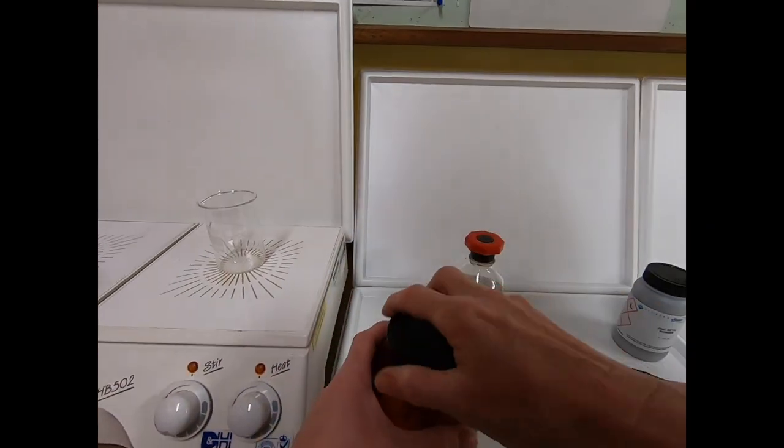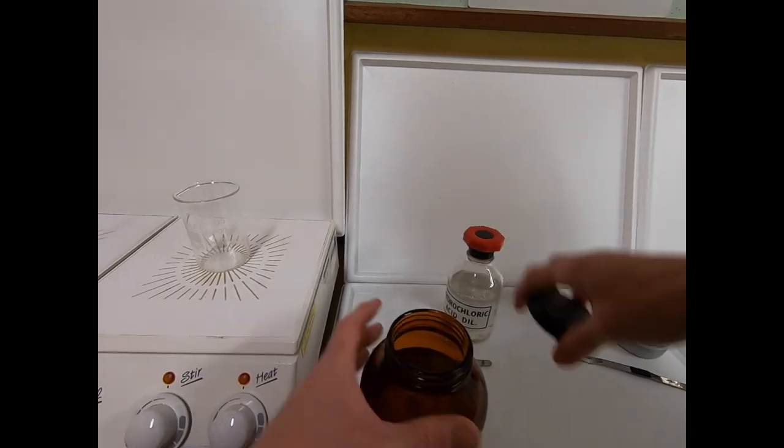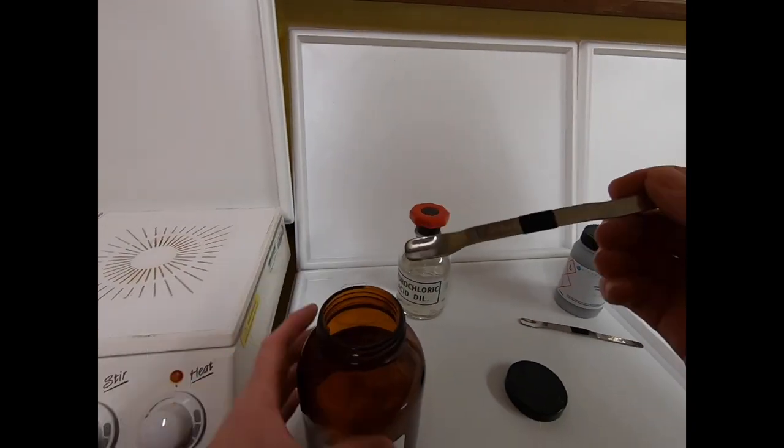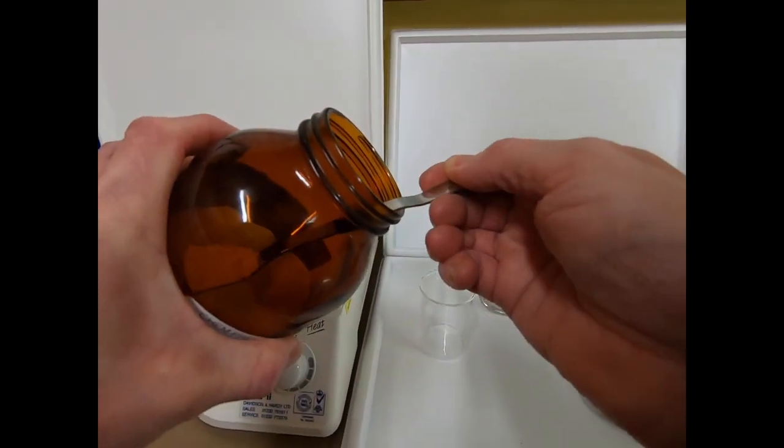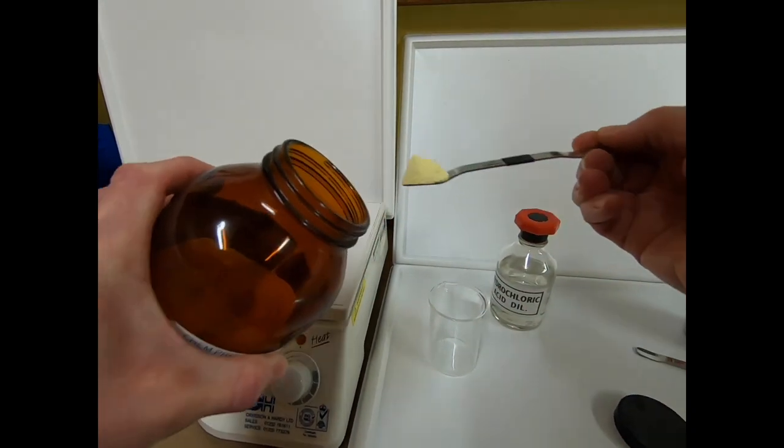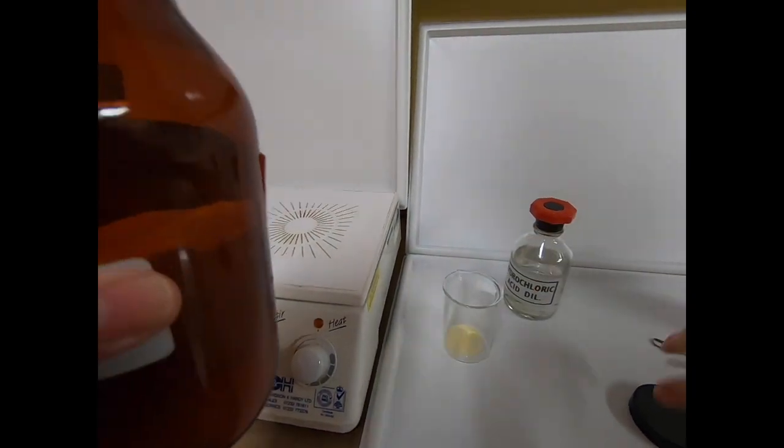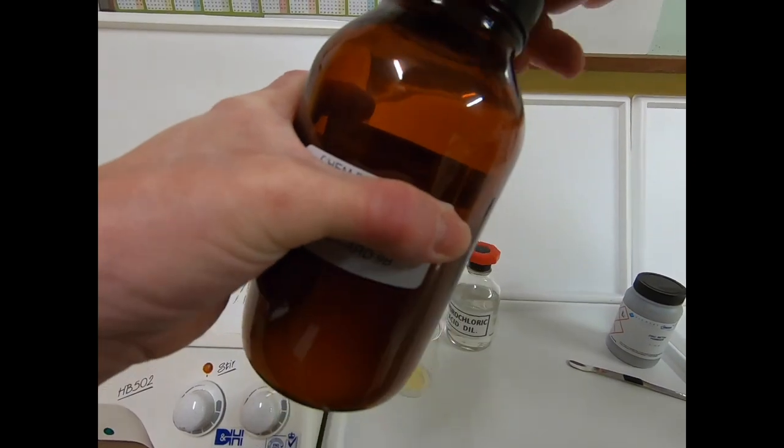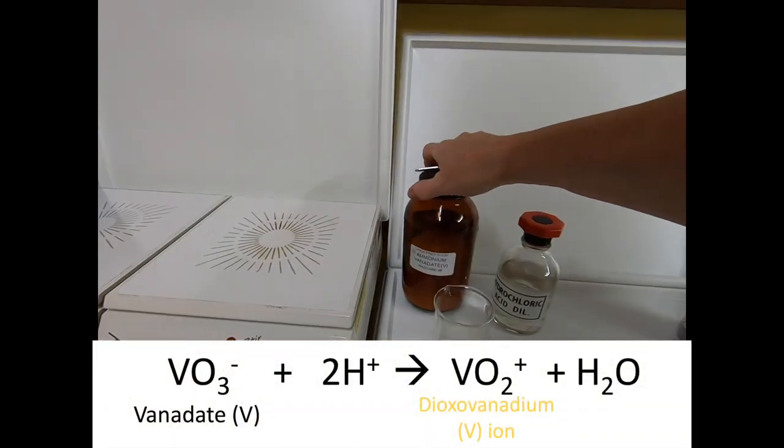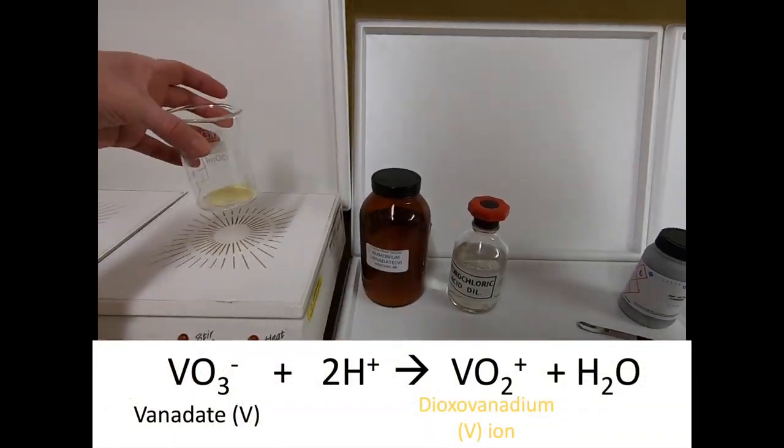In this video we're going to carry out the reduction of acidified ammonium vanadate(V) with zinc and observe the sequence of colors that we see. First, the ammonium vanadate(V) is acidified using hydrochloric acid. This converts the vanadate(V) ions into dioxo vanadium(V) ions.